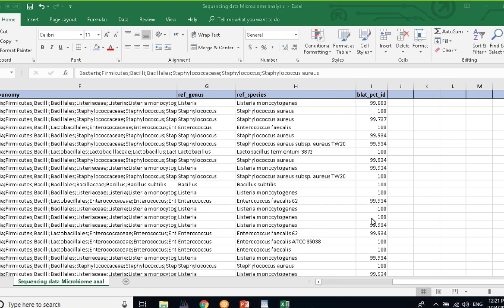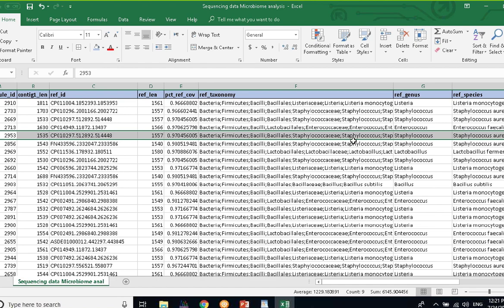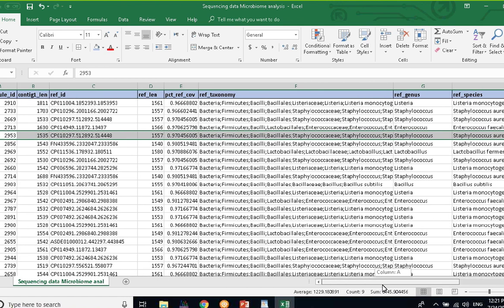And then what the percent ID was to the reference chosen in the database. So this is just an example of the statistics that we generate for each and every single molecule that we sequence: the sequence, the length, the full identity, and statistics about how well it aligns to the best reference chosen for it in the databases.